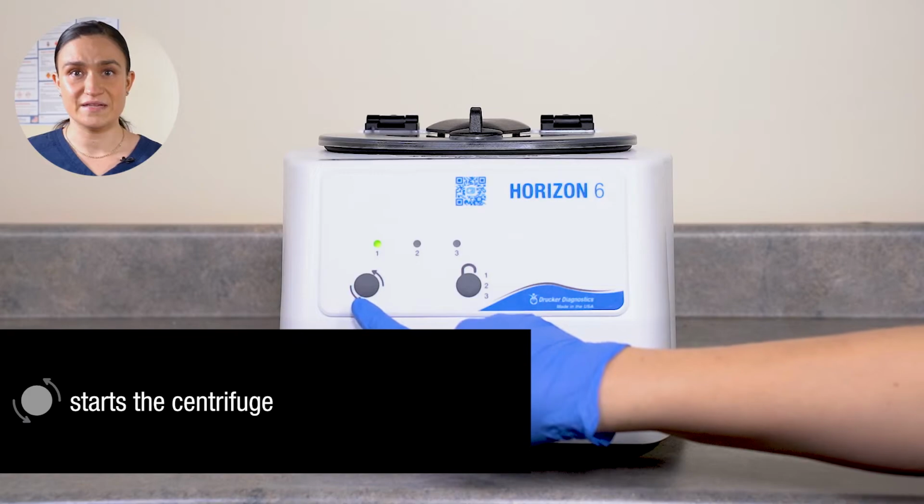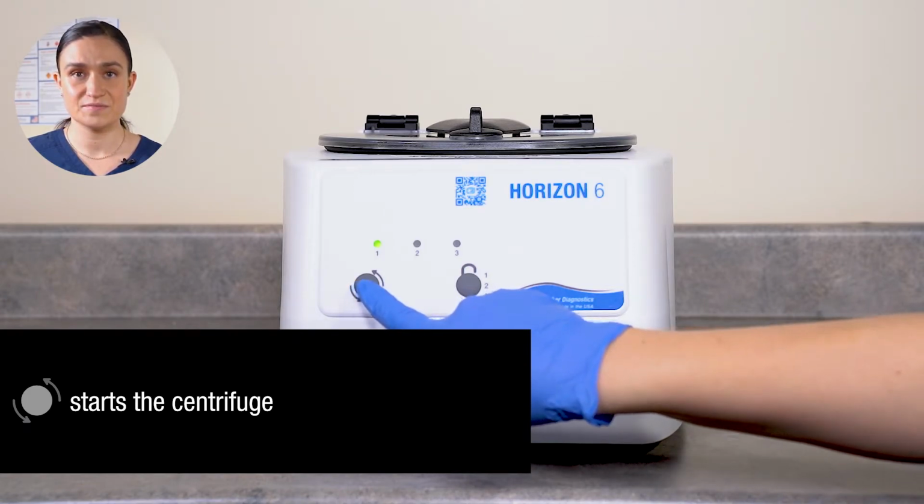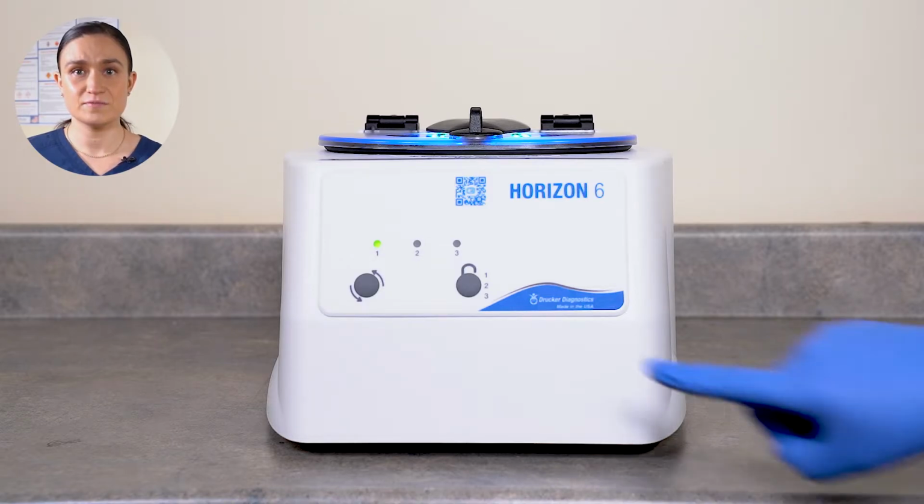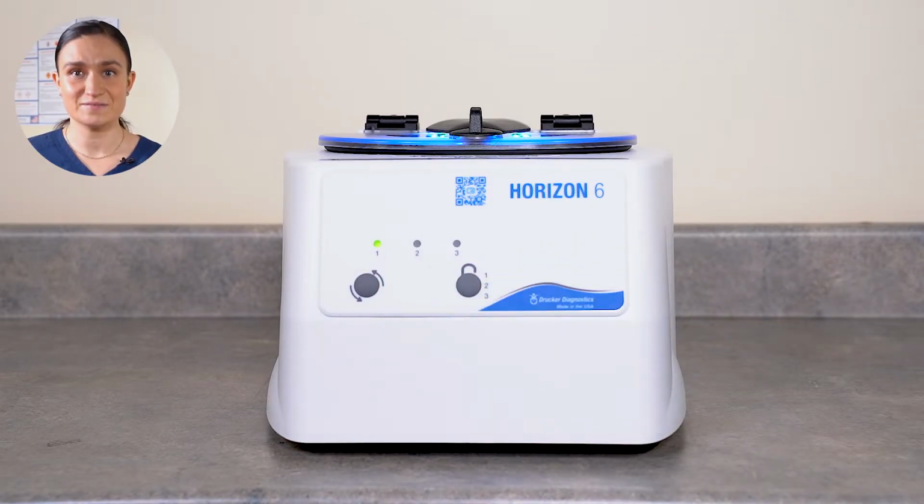The Start button starts the centrifuge. When you press Start, the Horizon 6 will begin to run its currently selected cycle. And those are your controls. Now let's look at how to load your Horizon 6 and spin your first samples.